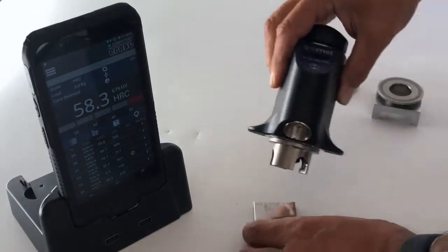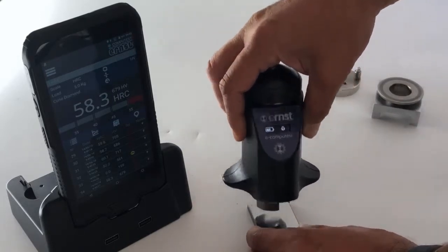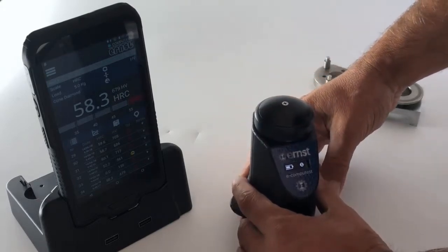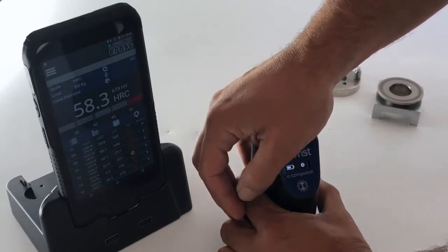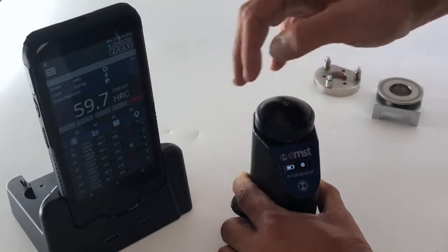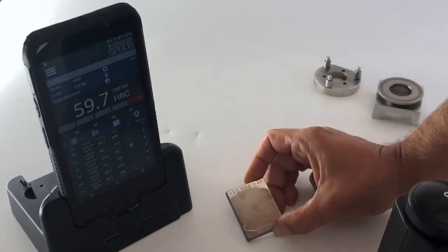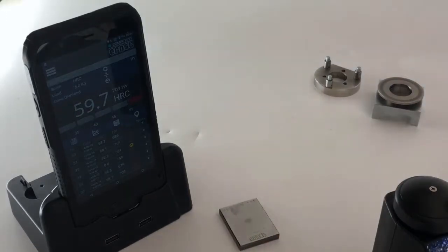Place the instrument on the surface, making sure you position it on the right spot. With one hand holding the unit and the other pressing, apply approximately five kilograms of force, then release slowly. The result is 59.7 HRC, which is exactly within the expected range of 59.8 ± 0.5 — perfect accuracy.